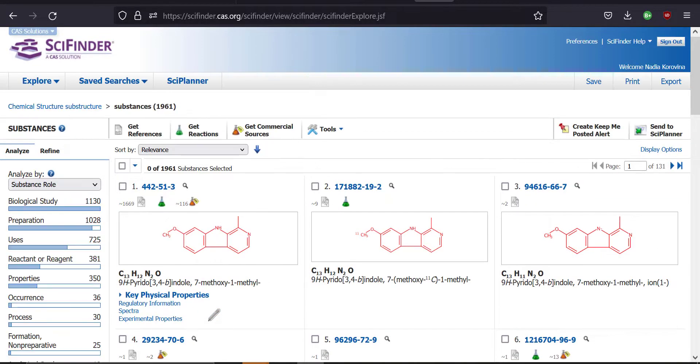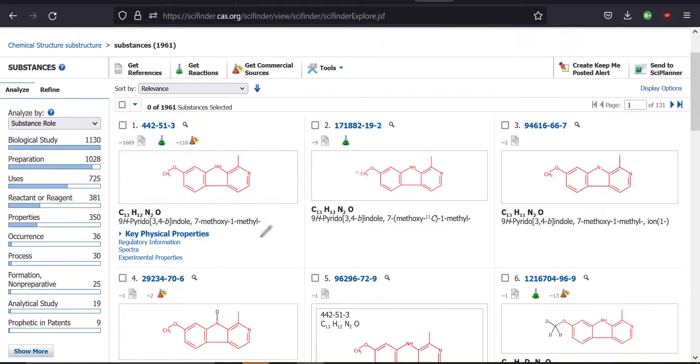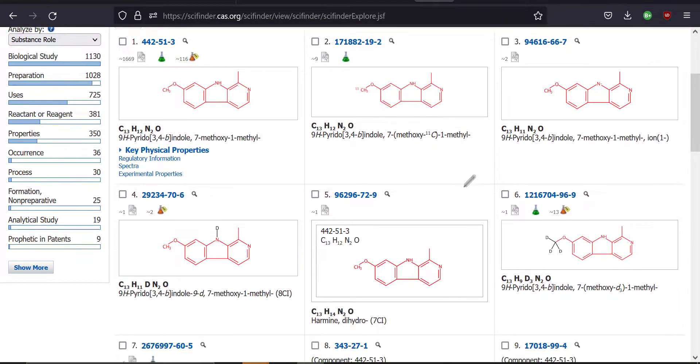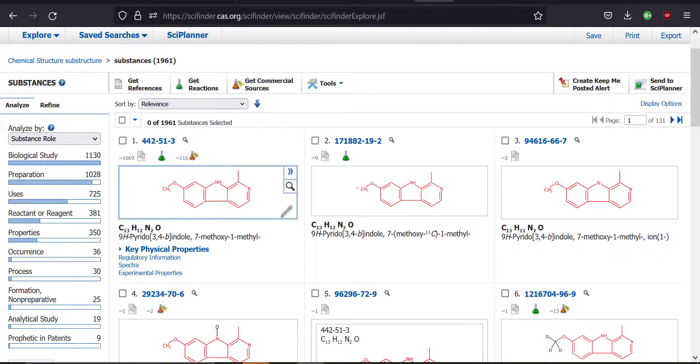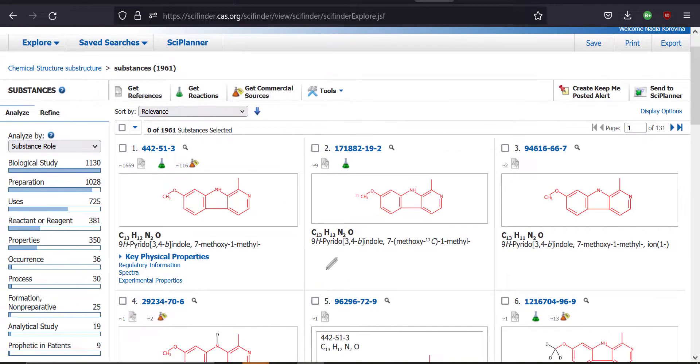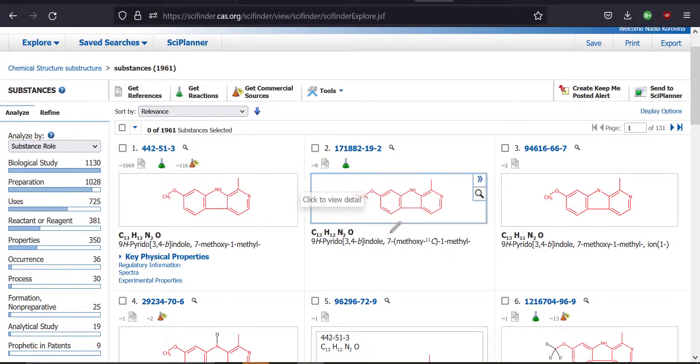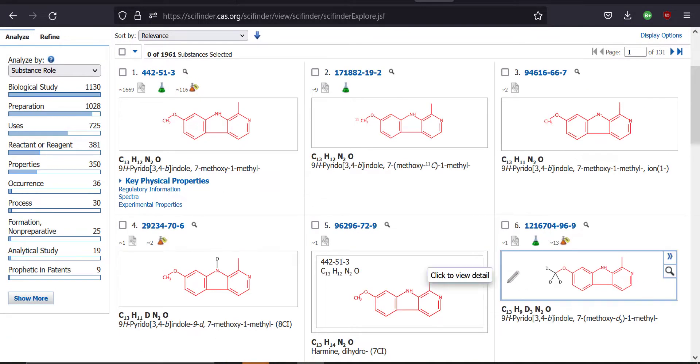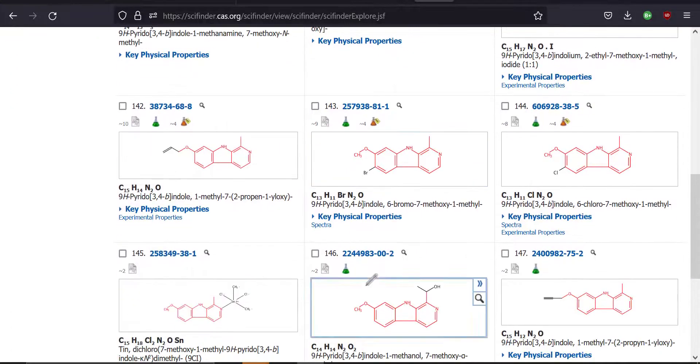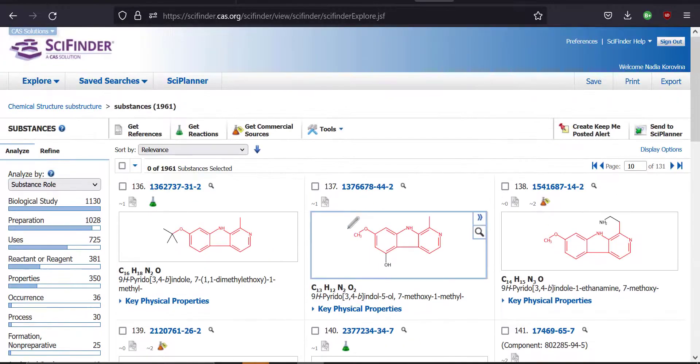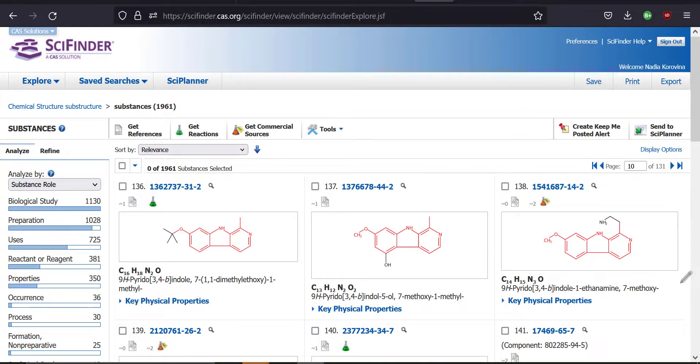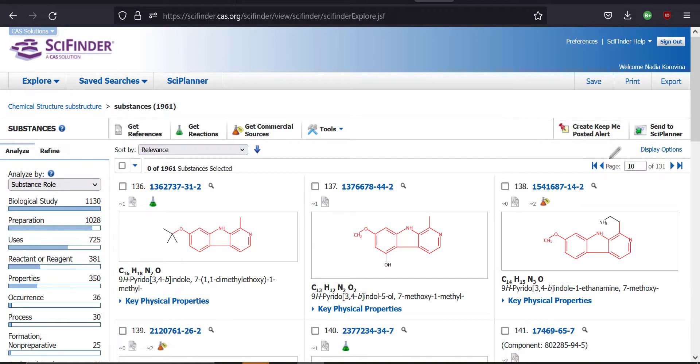And notice that this gives us a lot more options, right? The first search when we just straight up searched for harmine, we got harmine and nothing else. Now when you search it with a structure method, instead, you're going to get various derivatives of it. You're going to get deuterated ones, all kinds of other ones. This could be useful if you wanted to see what other related molecules people have made. But for me, I'm just trying to see how to synthesize harmine. So let's go back to the first page.